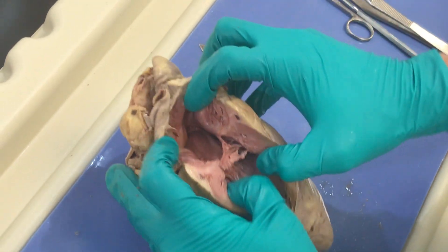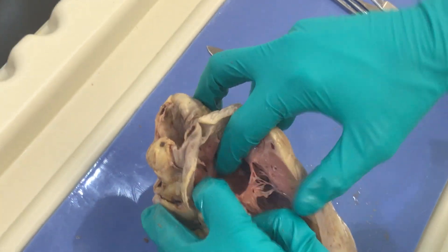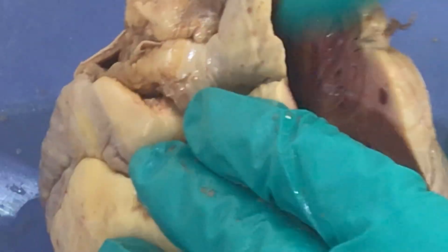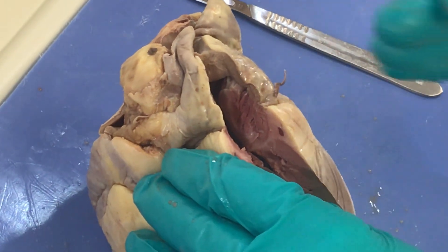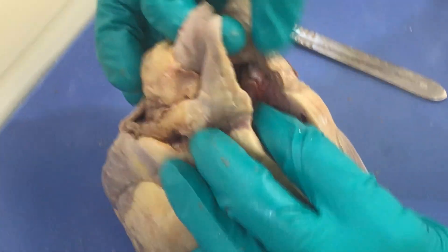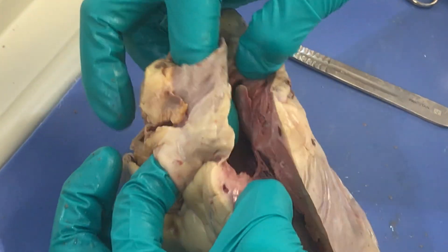A couple of structures we want to point out: one is the smoothness of this endocardium. This is that smooth tissue lining the heart, and it's contiguous with the vessels. The endothelium of the endocardium is contiguous with the vessels that we have. We have the superior vena cava coming in here and the inferior vena cava coming into the right atrium here.